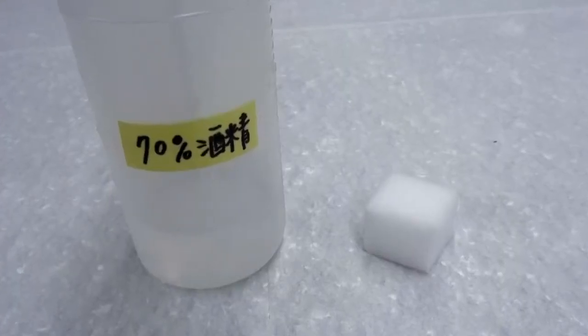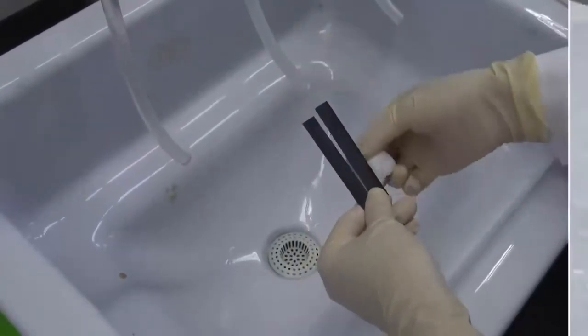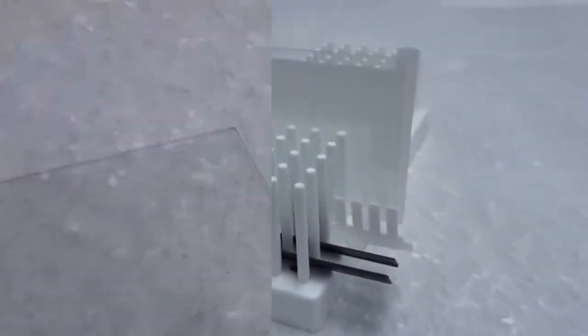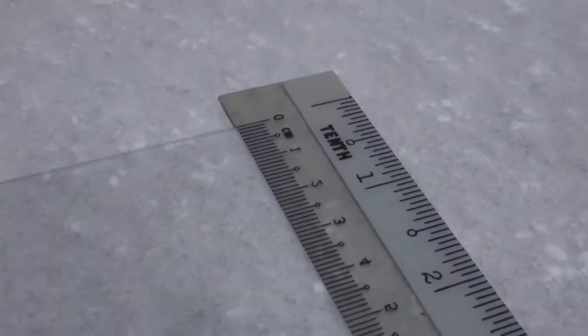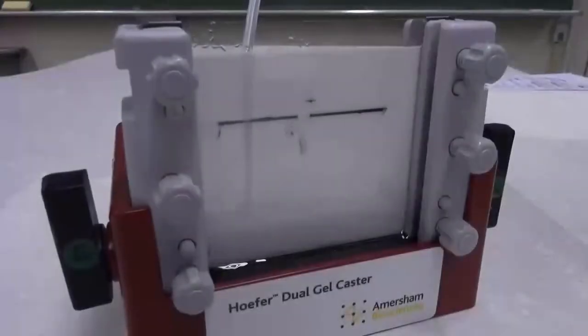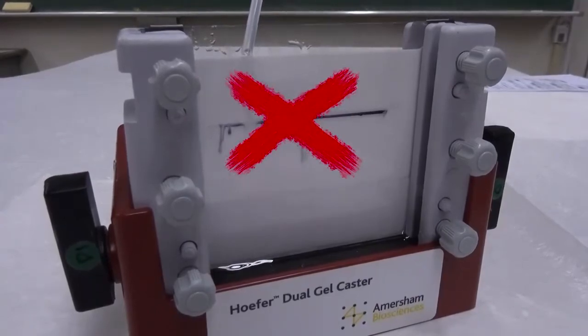Clean one glass plate, one ceramic plate, and two spacers with sponge and ethanol. Wipe with Kimwipes and allow them to dry completely on a rack. Mark a straight line on the glass plate about 3 cm from its upper edge. This line can be used as a reference for the level of separating gel. Make sure this side is facing outward. Otherwise, the mark will be washed off by the gel solution.